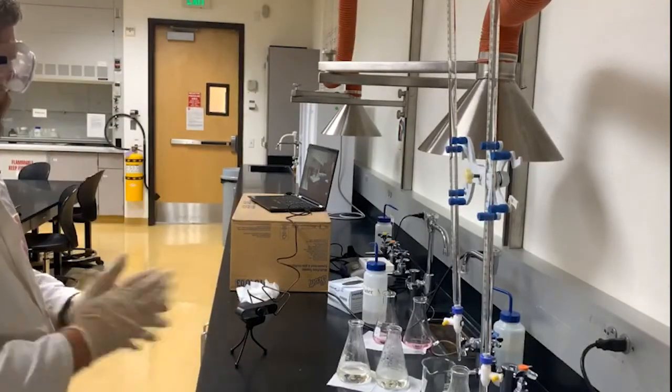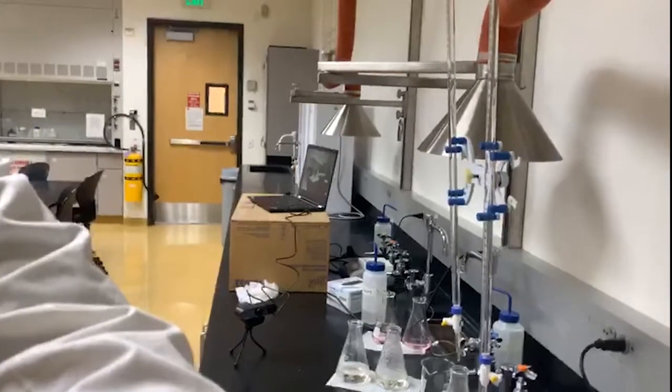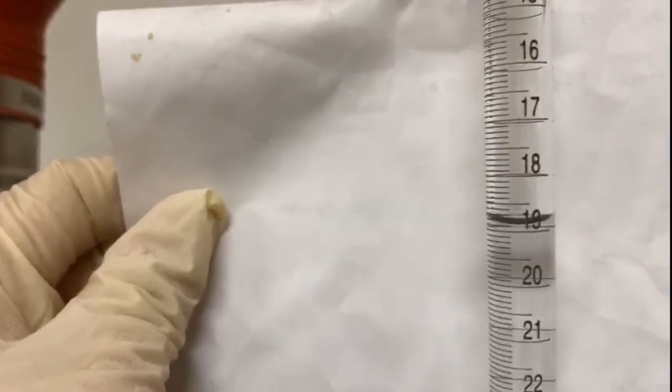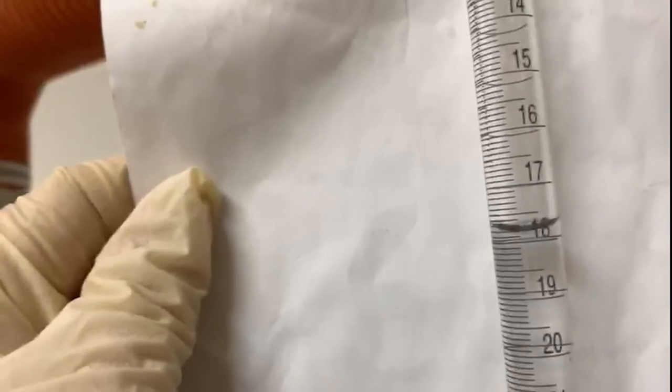All right, we have now completed both of our titrations and eliminated the original methyl red coloring agent. So we're going to take our final burette measurements, and then I'll make my final comments before you move to the data calculation section. So this is the Erlenmeyer A, and our burette reading you can take from the meniscus. Okay, it's focused. And remember, because that's above 19, it's slightly less than 19. Pro tip. And this is our other sample, which is Erlenmeyer C. And take your measurement from the meniscus there. Okay. And that concludes the data collection.